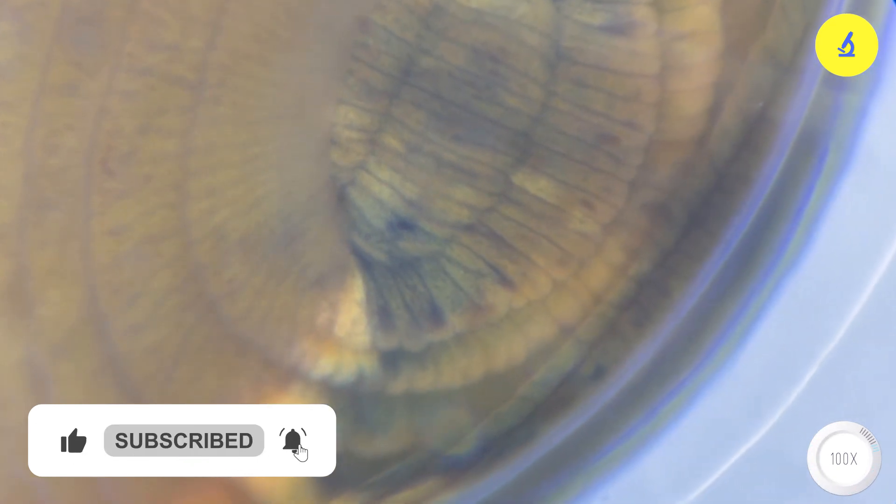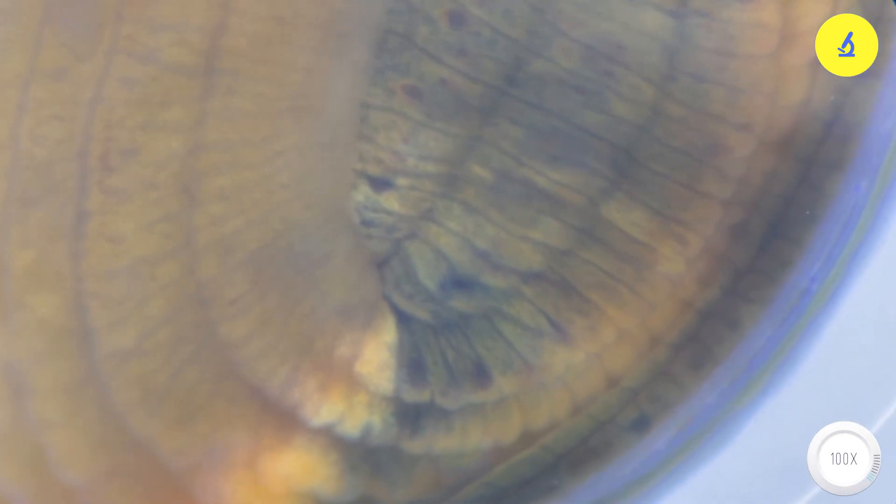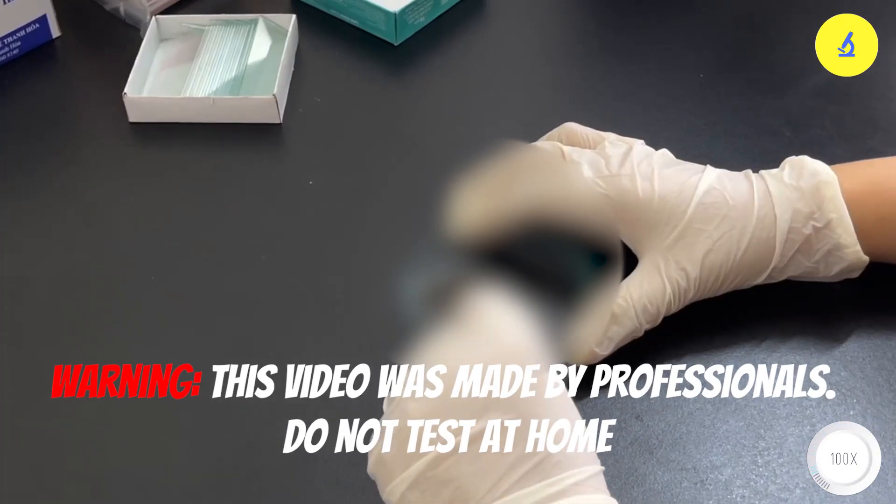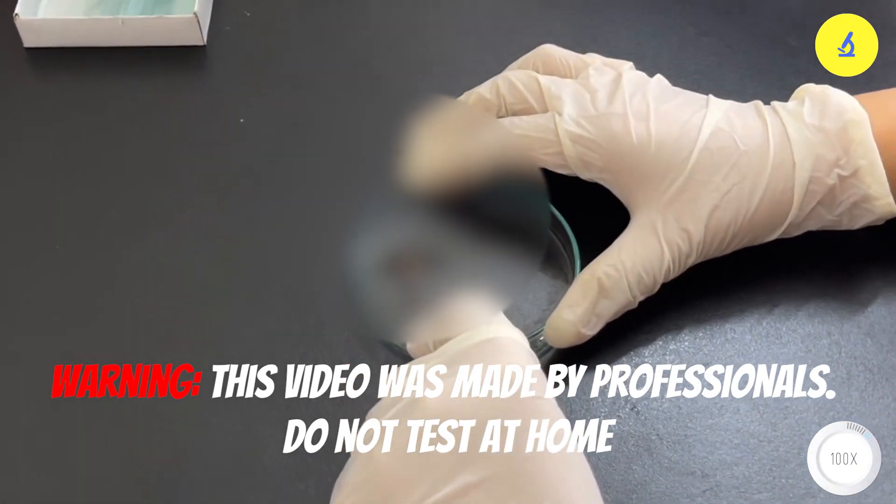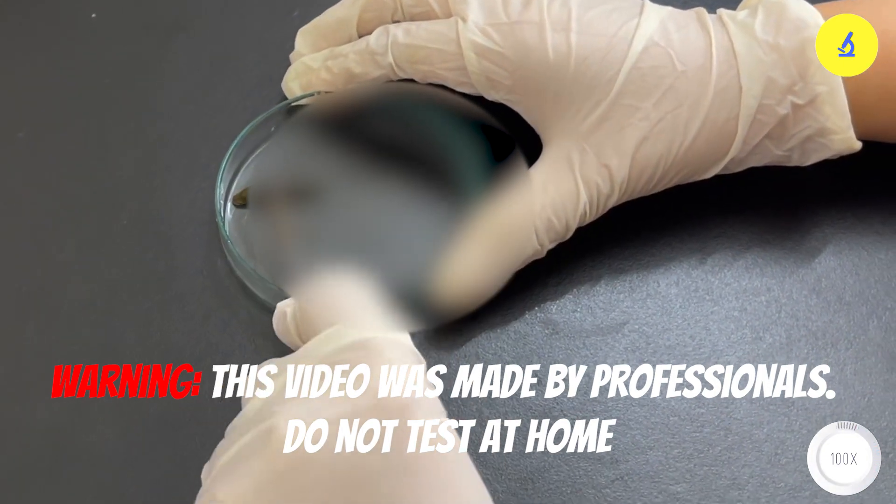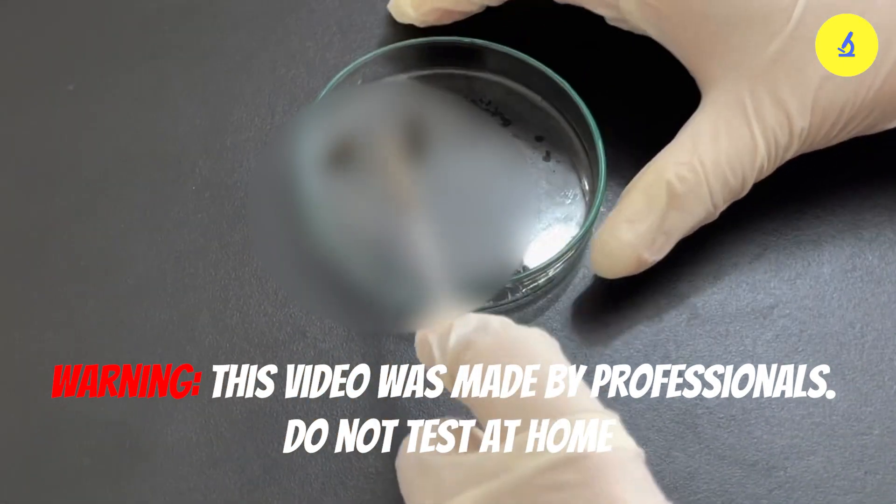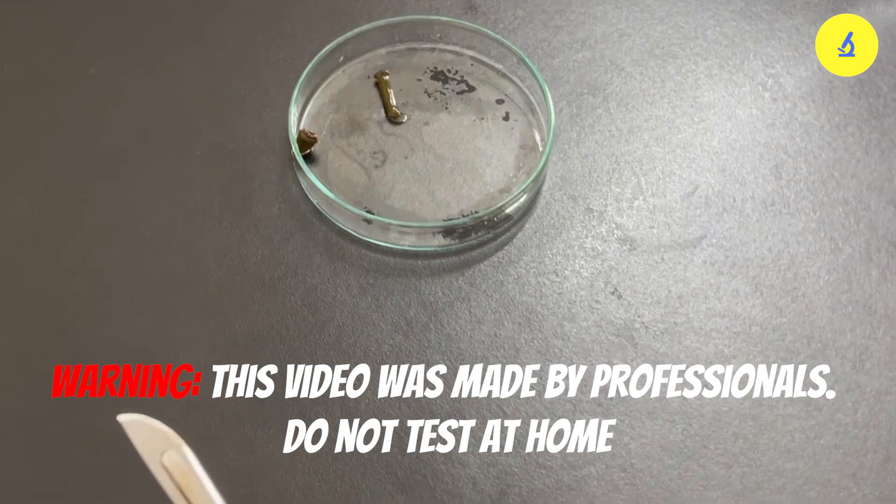Leeches are considered demonic creatures because each segment of the leech has the ability to regenerate and form a new individual when cut in half. For example, if we cut a leech in half horizontally like this, one leech will become two leeches. That's why it's called a demonic creature. It sounds like a horror movie. Hey, it's still wriggling around. Oh no. If it jumps and lands on me, I might faint.